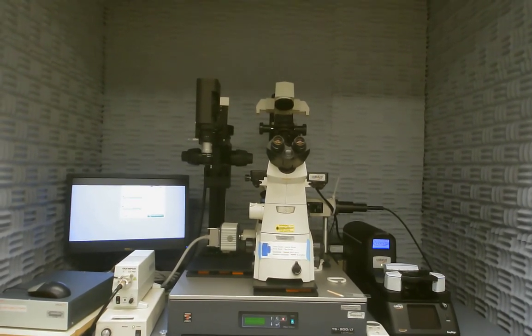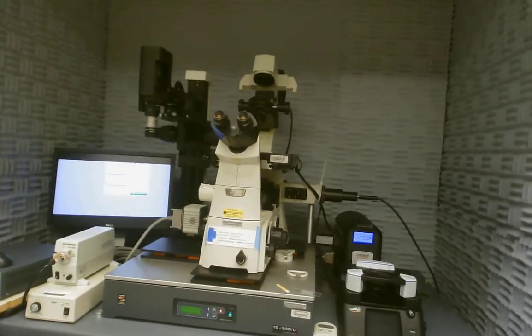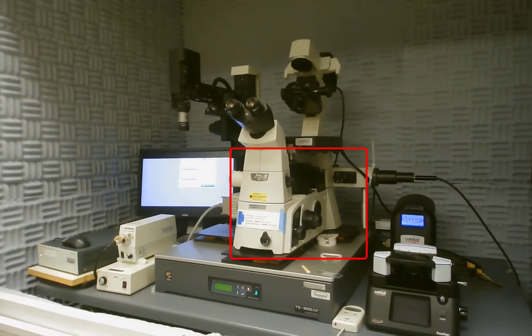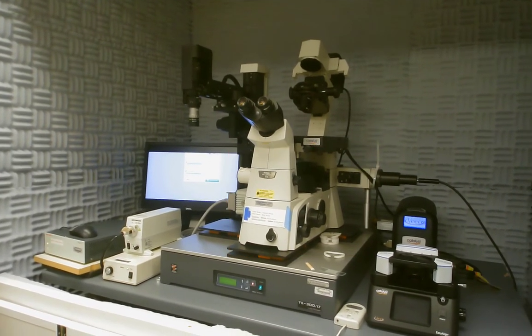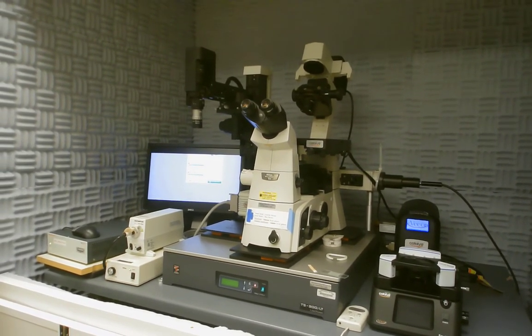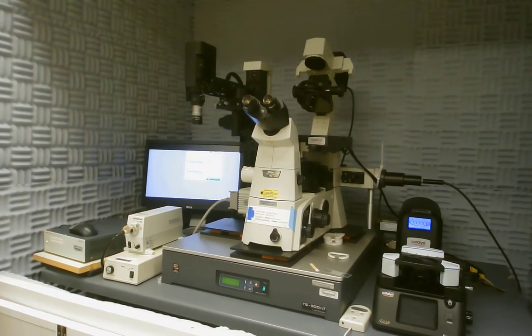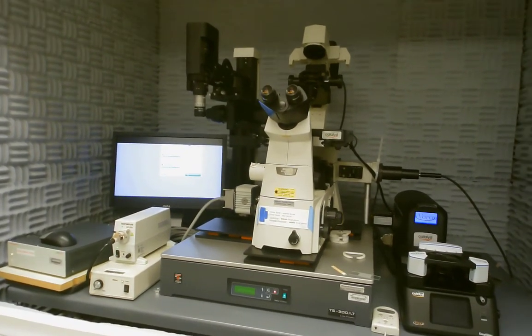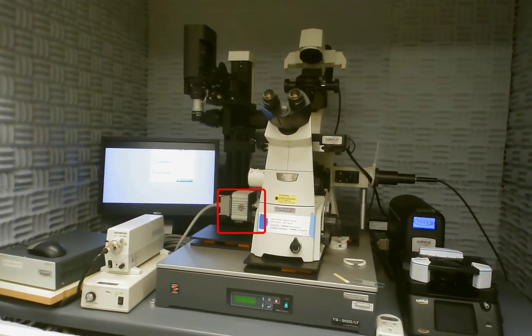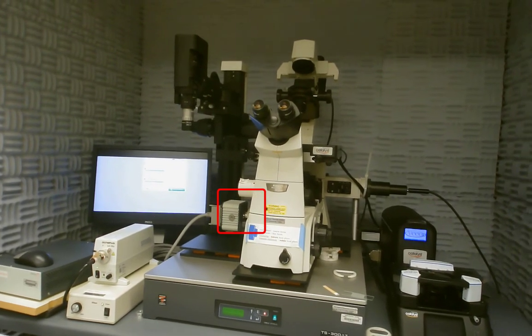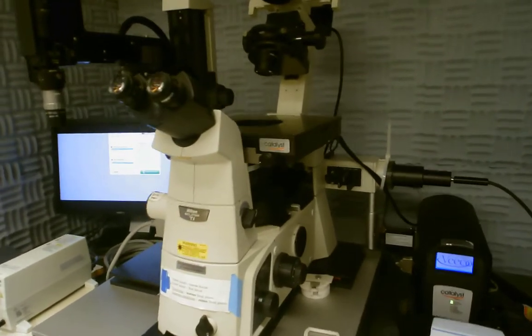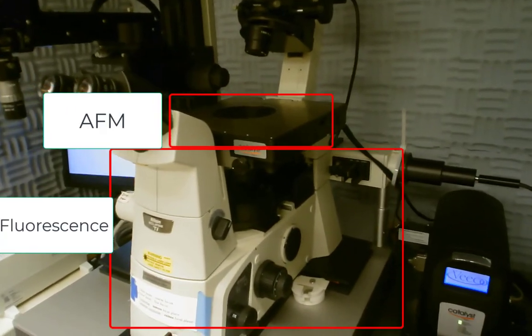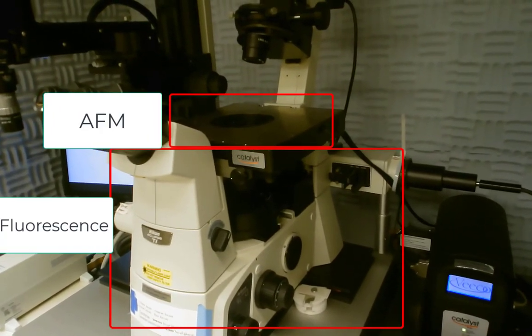This system is unique in that it is mounted on an inverted fluorescence microscope. So you can actually do individual or combination measurements of fluorescence microscopy, which has its own CCD camera down on the bottom left of the microscope. The AFM imaging takes place above. So the fluorescence takes place below and the AFM takes place on the top.